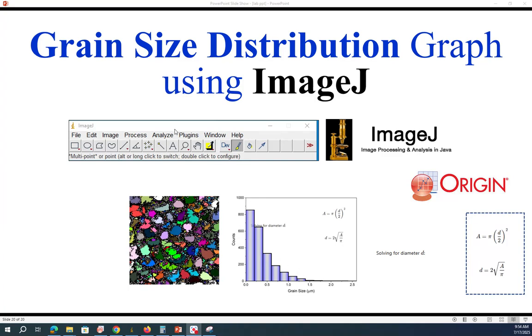In order to measure the grain size distribution, we have to measure the grain size. So these are the grains. In fact, we have to measure their area, and for area we will use the ImageJ software. Then we will use Origin to measure their diameter.